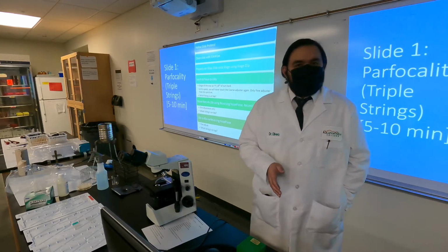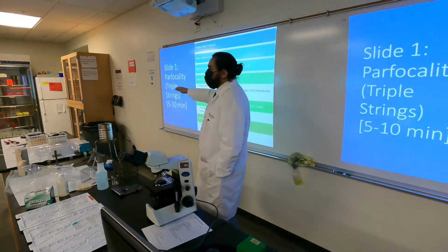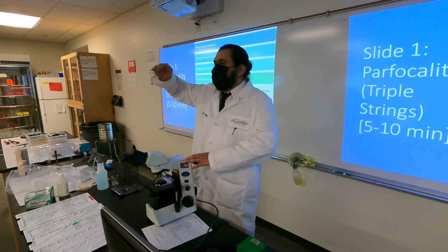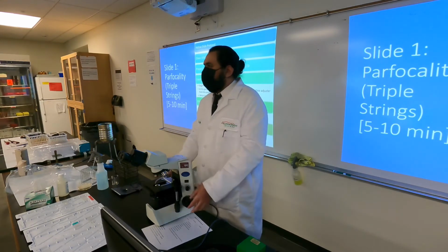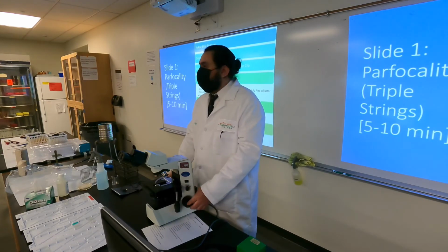Now, a couple of warnings behind this though. One is we want to teach you what parfocality is. This idea that once you already have it nice and focused, all the other steps are usually focused as well. Not perfectly, but decently. So that means you need very little adjustment using the fine adjuster only. Again, never the coarse adjuster, just the fine one.